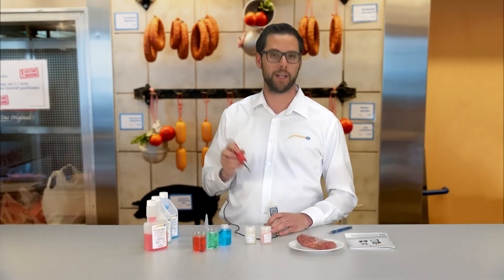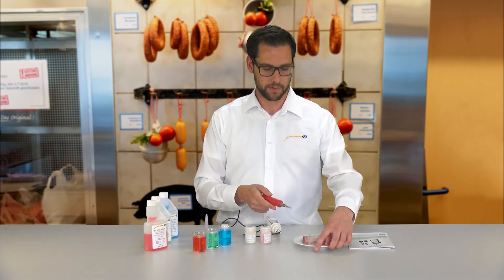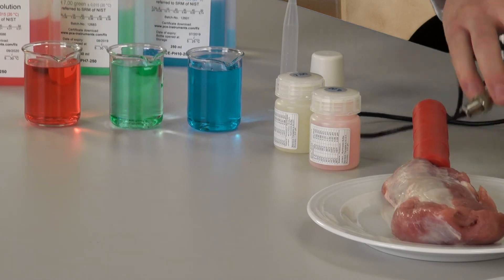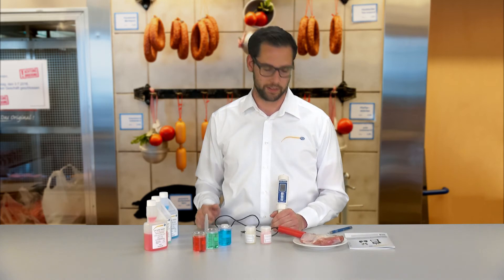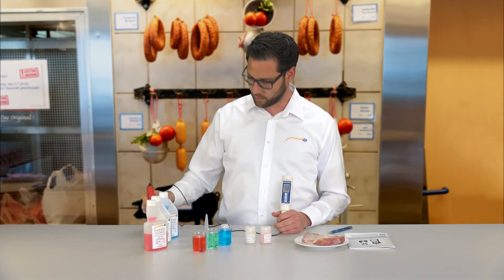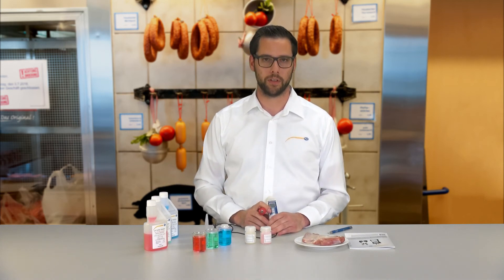We have here a small piece of meat from which we will measure the PH value. We insert the electrode into the meat and the PH value can be seen directly in the display. After the measurement, the electrode is taken out of the meat, rinsed in distilled water, and the measurement is finished and the device can be stored again.